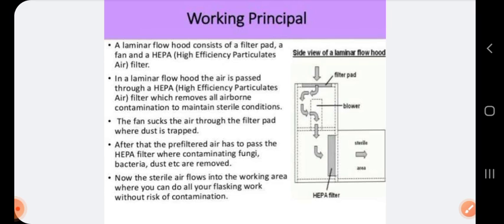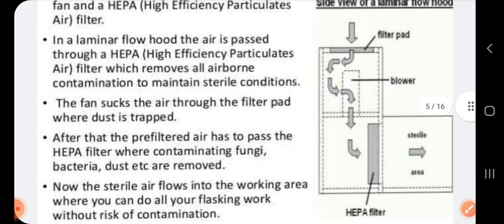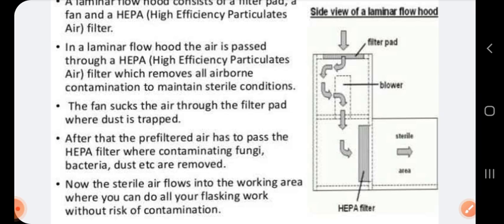You can study them. Now, a laminar airflow has a number of small blower motors. If you see the diagram, these blower motors blow the air, which passes through a number of filters, and that filter is called HEPA filter, high efficiency particulate air. I think all of you know the name of the HEPA filter, because nowadays we are trying to use the N95 mask that contains a HEPA filter. HEPA filter is very, very costly, and that's why the original N95 mask is so costly.